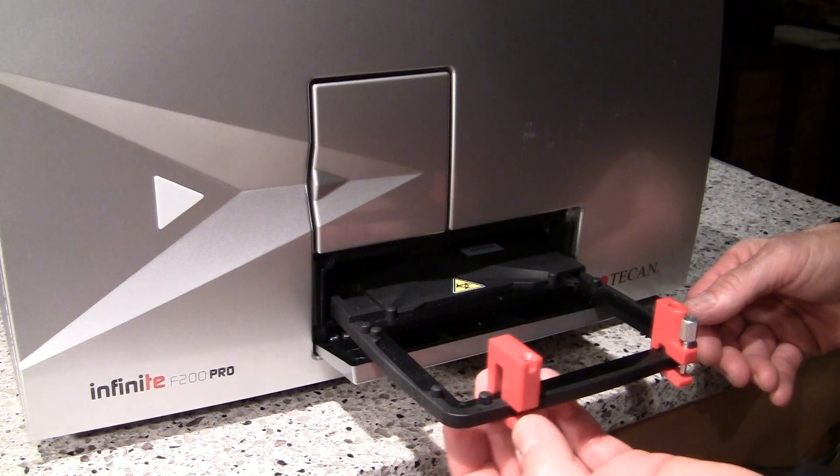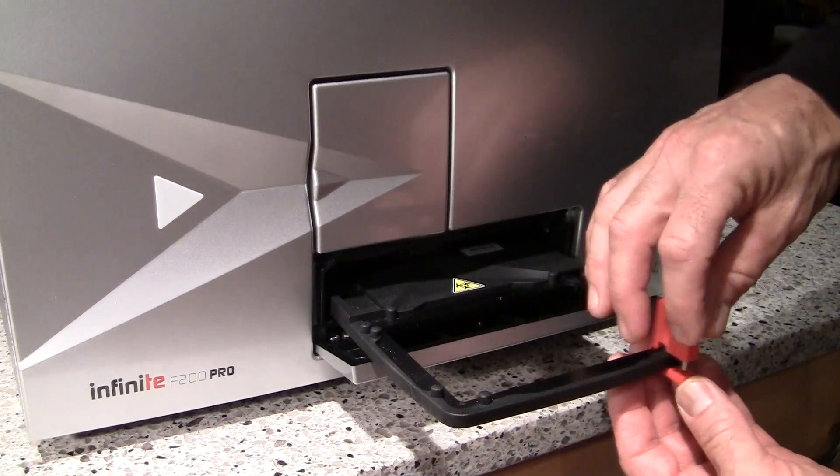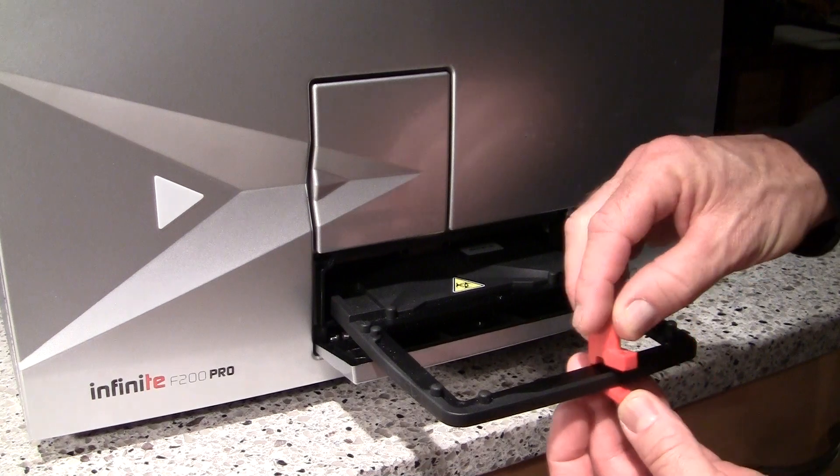Alright, the locks slide off like so. This one will slide off, and you can set it aside. For this one, it's best to remove the screw entirely, and then as you start to guide it off, you may have to bend it open ever so slightly to get it to come off.